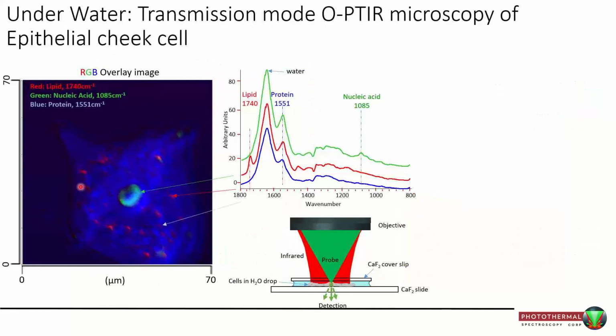Live cell imaging presents itself as a huge opportunity with this sort of technique, because it works so well in water, unlike regular IR.